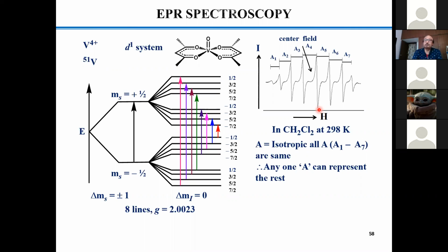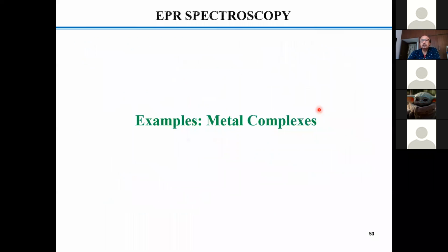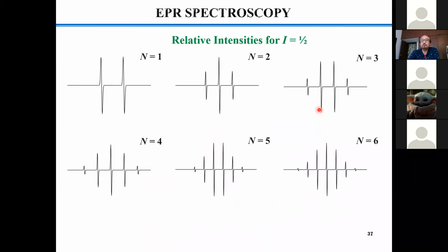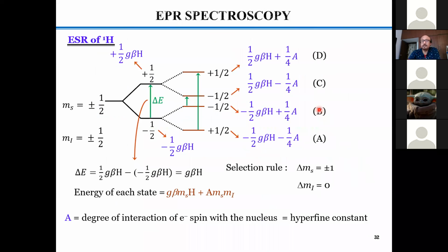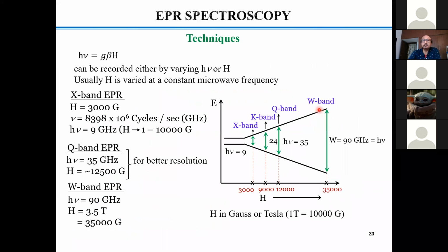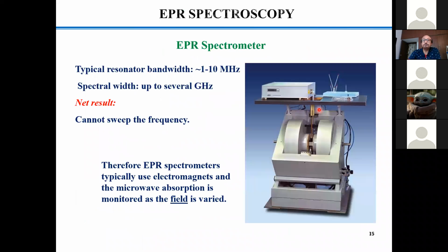So if you put a little bit of standard within the EPR cavity, what normally people do, this comes along with the instrument. Actually, one doesn't need to be worried, but nowadays it has been modified. Till a few years back, people used this kind of situation. You can see the EPR cavity, this golden color. Within this cavity, they put a pinch of the radical. EPR is very sensitive.